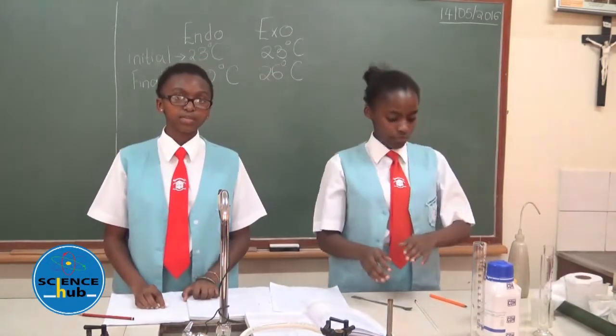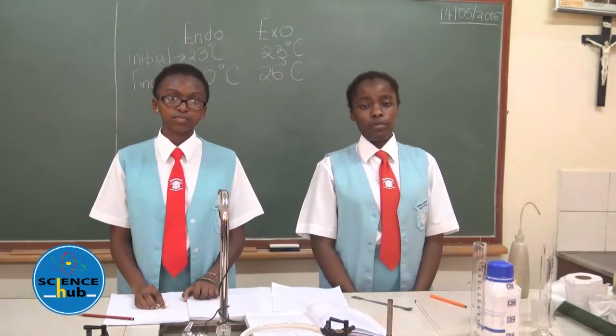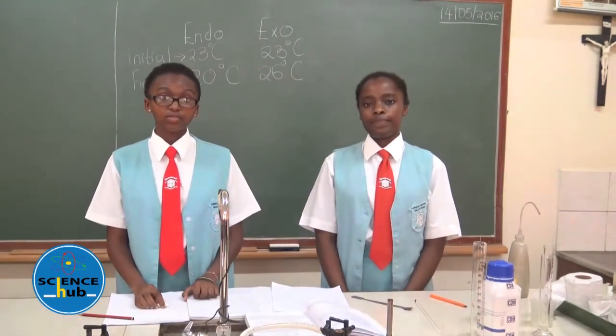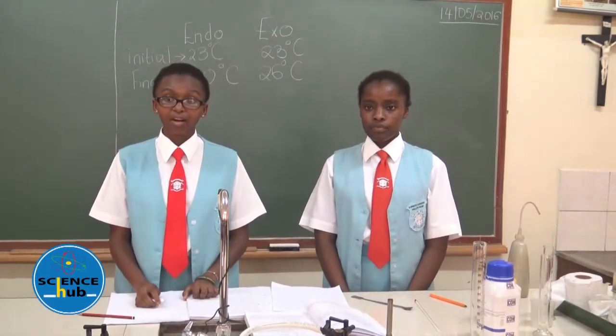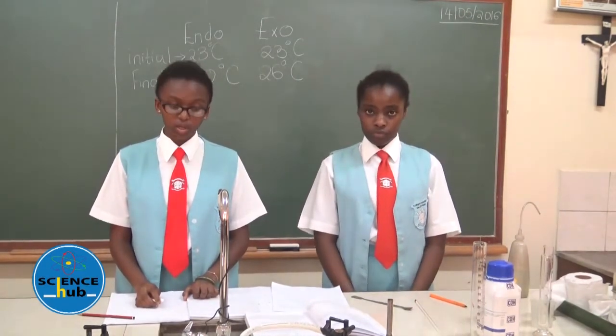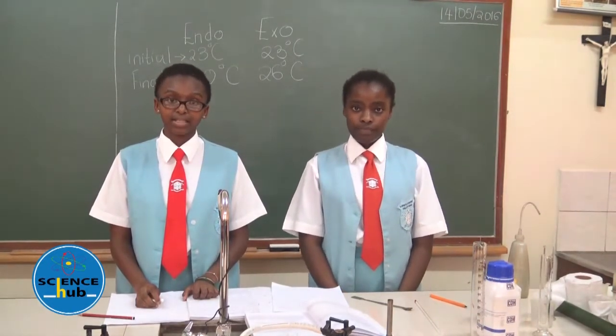What did we note? We noted that the temperature rose once we added sodium hydroxide pellets. This is very correct. In an exothermic reaction, temperature rises after the solid dissolves in the water. This is because an exothermic reaction emits heat.